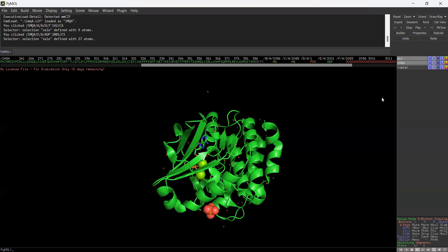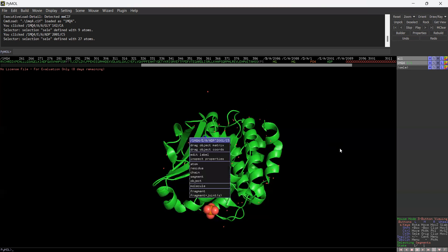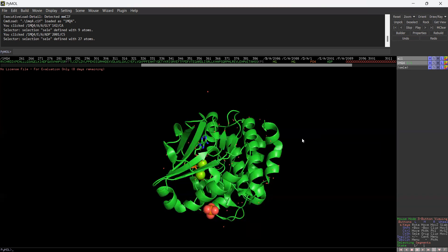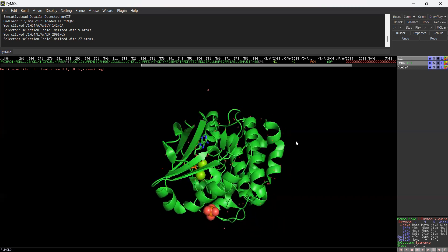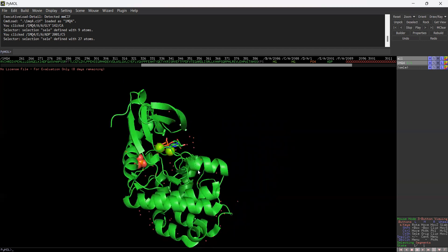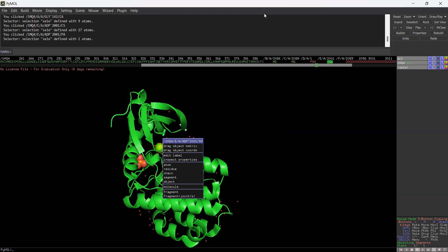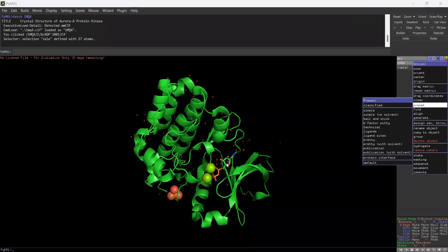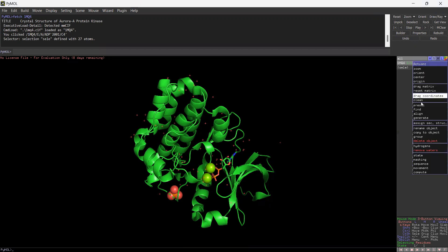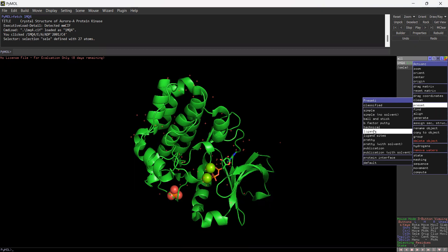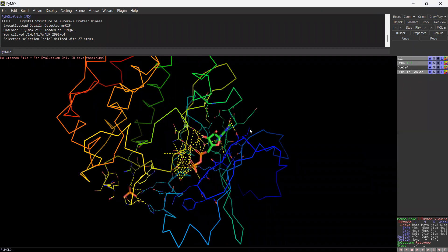We are going to go stepwise to explore this complex. Right now I'm zooming and I'm interested to select the ligand. To get the particular ligand interaction, what you have to do is go with the Action from here, then look for Find, and then you can go for Ligand. If you click over there you will find the particular interactions of the ligand with the residues.